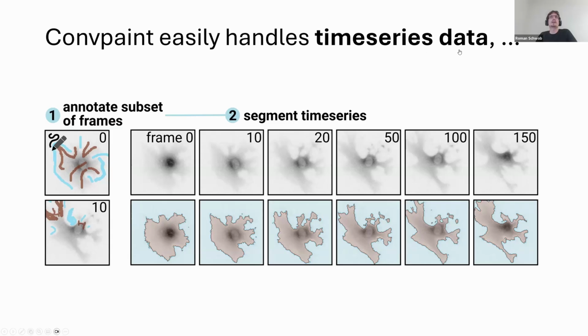So that means time series, where for each time point you have what we had before. So at time 1, you can have a grayscale image, at time 2, 3, 4, and so on, as you can see here in this slide.